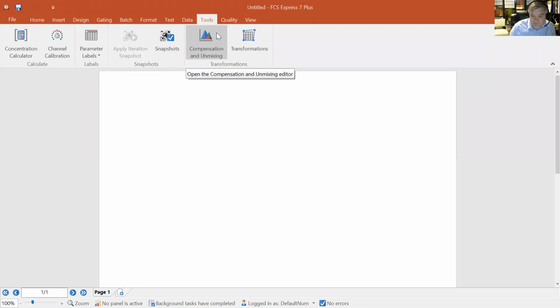Once you pop in whatever fluorochrome it is, or fluorescent protein it is that you're supposed to be looking at, you can compare it and make sure that that single color is correct, that you didn't swap tubes, that there's no degradation of the dye or anything like that. So this is a really nice opportunity to be able to QC your single colors and make sure that they're appropriate. Yep, absolutely. So we're launched back up into the software here.